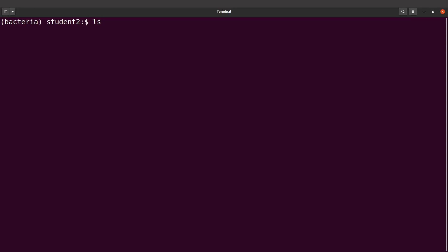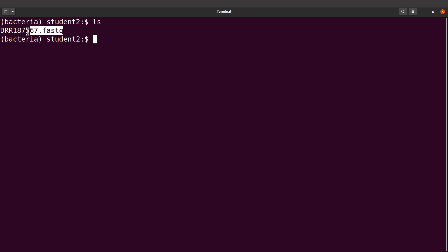Let's do an ls to take a look at the file. What we are going to do next is to perform quality control. We are going to do three things: first assess the quality of the raw reads, then filter the reads, and after filtering, assess the quality of the filtered reads. Then we are going to compare the raw reads to what we get after filtering.